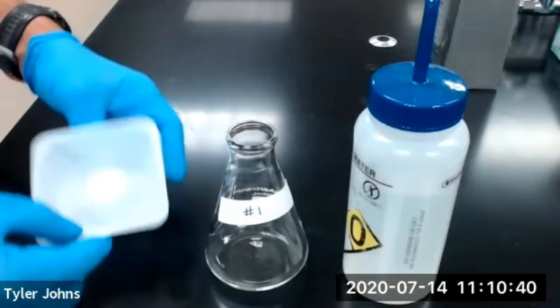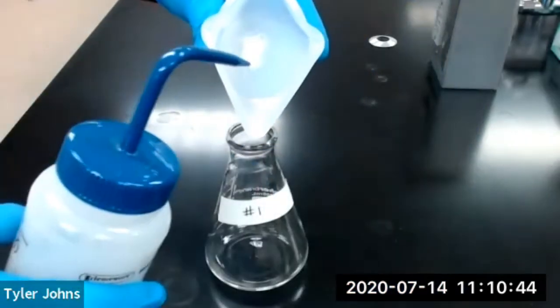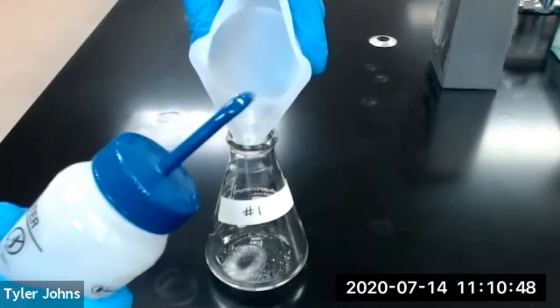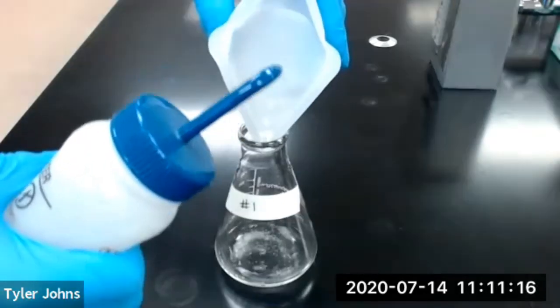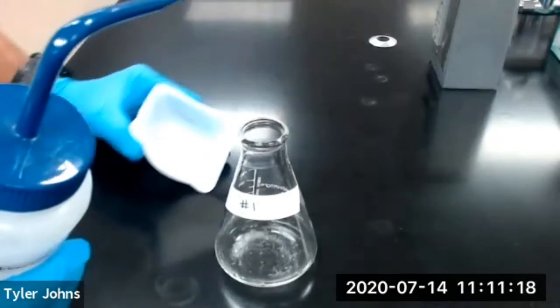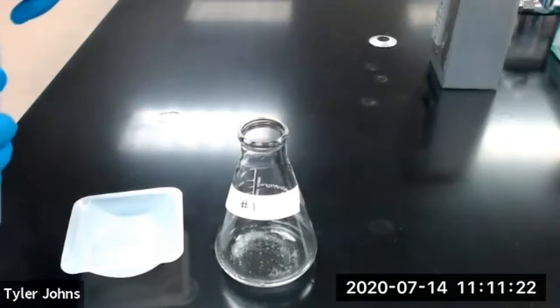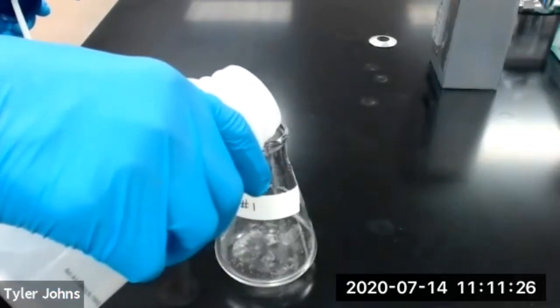We next need to analytically transfer our KHP to an Erlenmeyer flask. After transferring our KHP, we'll add approximately 40 milliliters of deionized water to help dissolve our KHP.